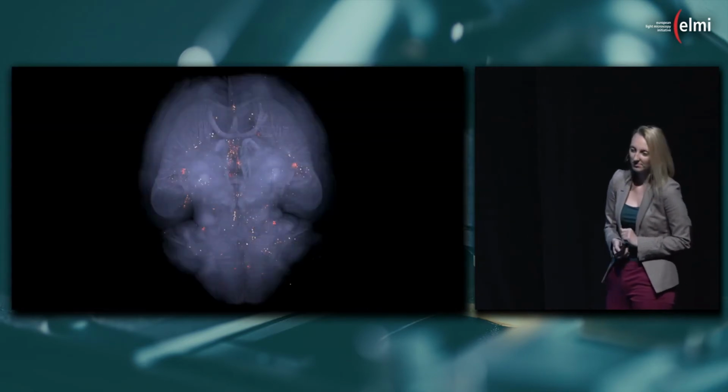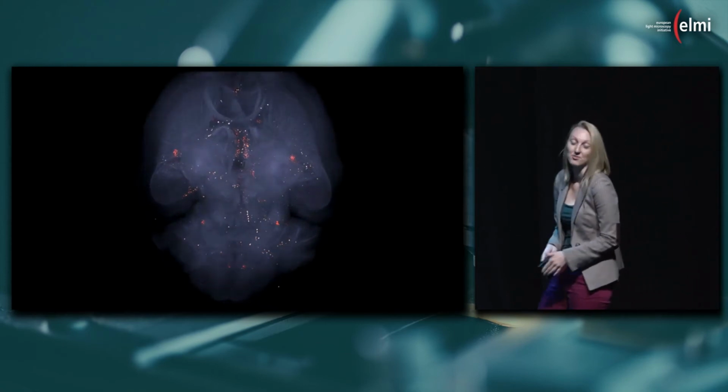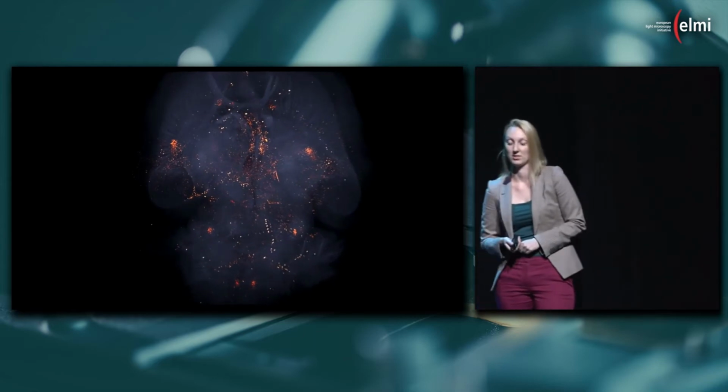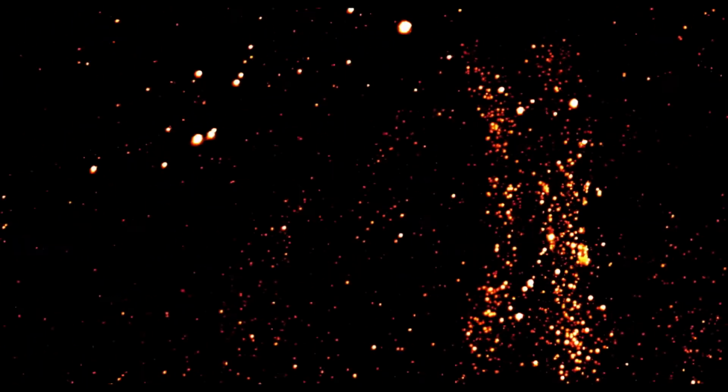Here's one data set, how our brains look. Very often we do brain activity measurements. Here you can see a c-Fos protein, which is expressed in response to a drug called semaglutide. It's a body weight lowering compound. We can image not only brain activity, but also drug distributions or neuronal populations, receptors, and of course axonal projections, etc.